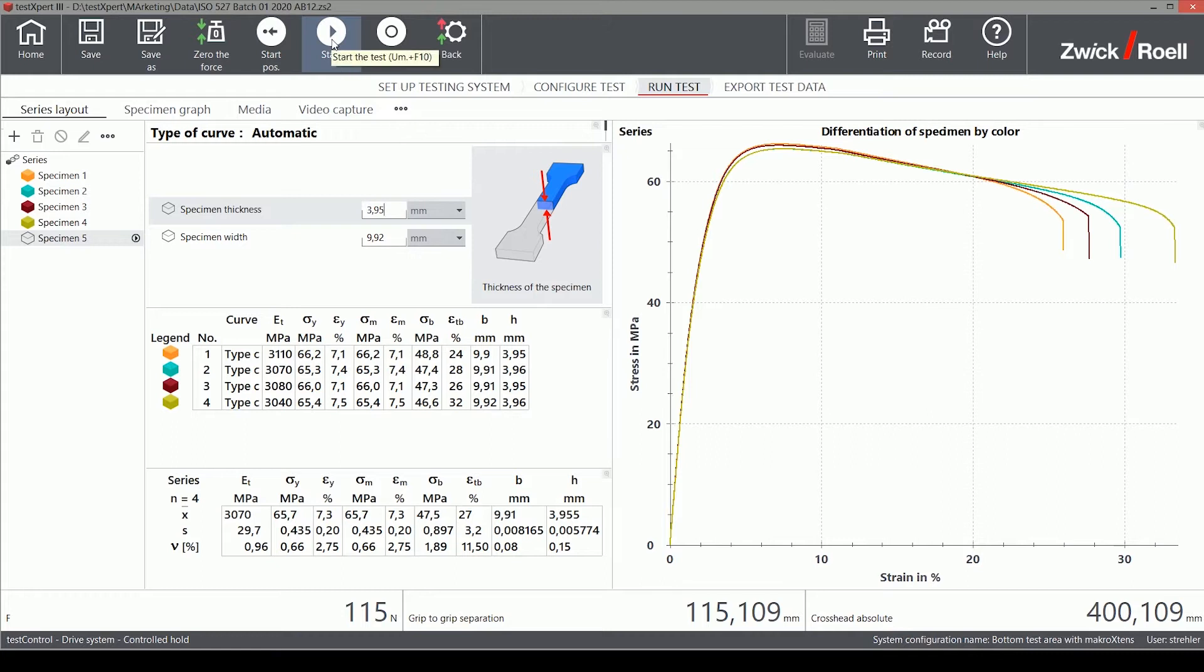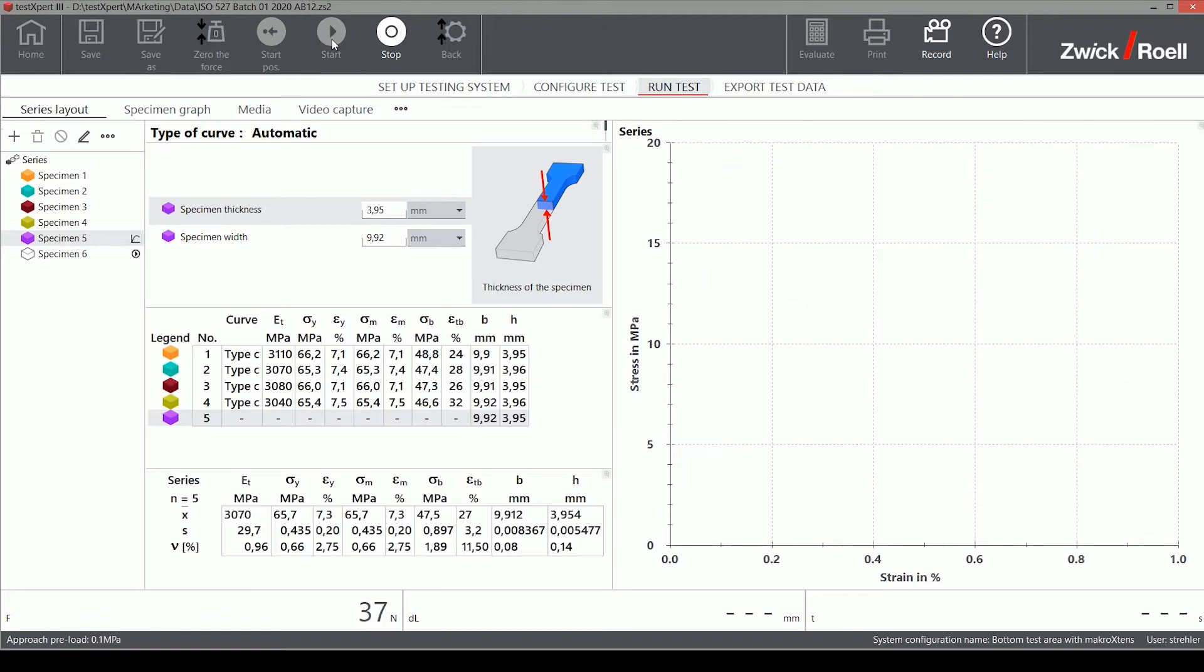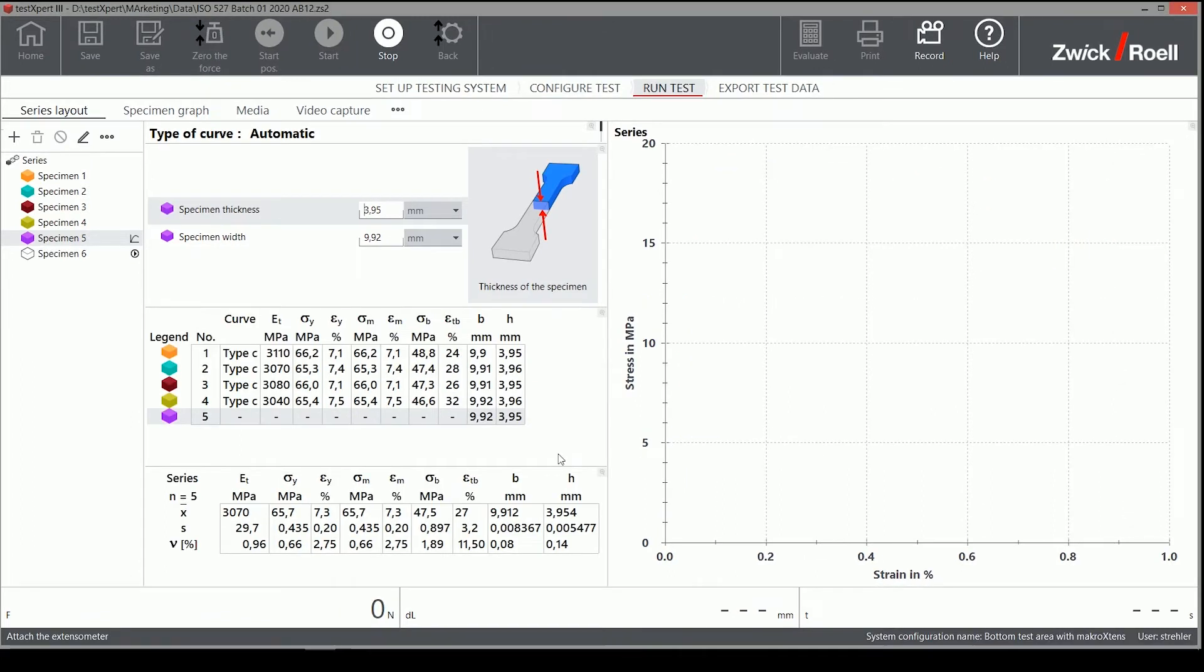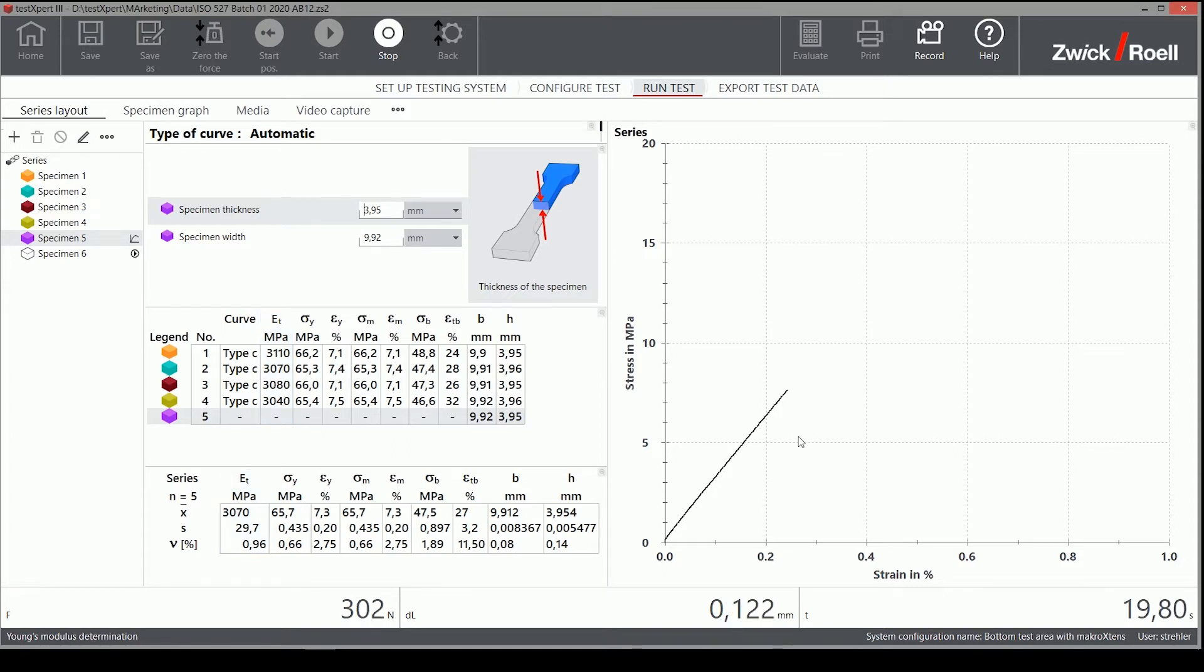Hello, today I want to show you in a short tutorial the Excel export function in TestExpert 3. This is the last sample I have to test from this batch. Our lab manager asks for the data in an Excel sheet as well as a PDF test report.